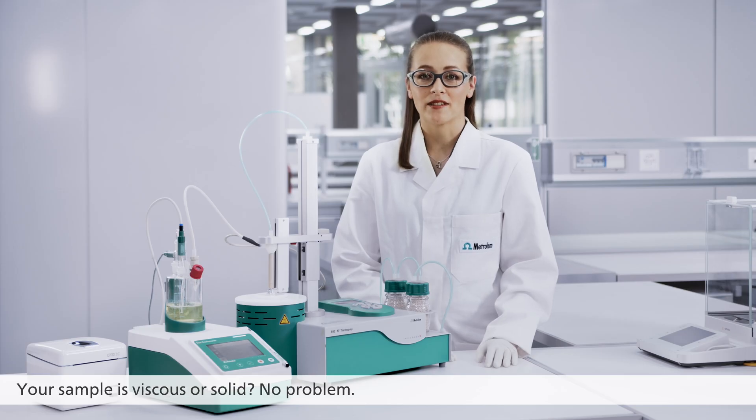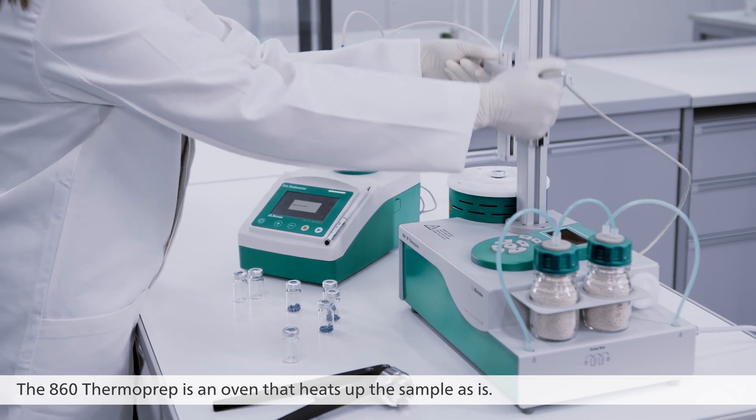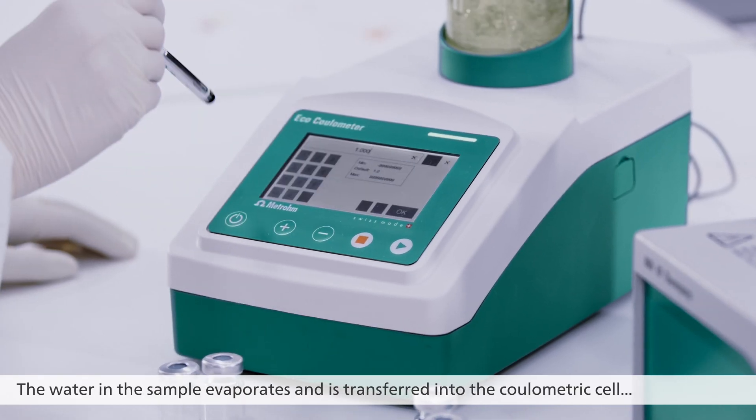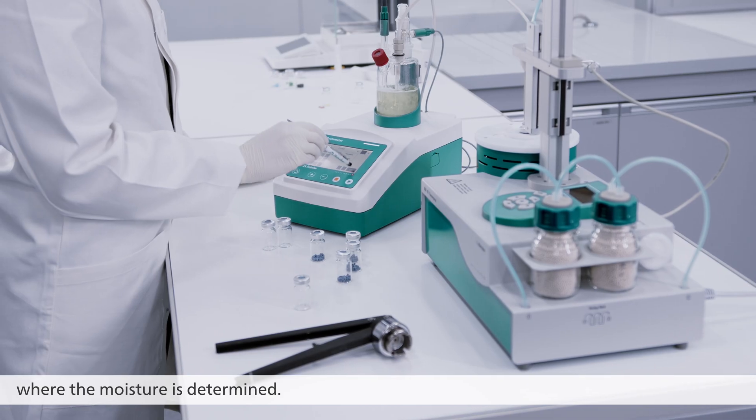Your sample is viscous or solid? No problem! The 862 Thermo Prep is an oven that heats up the sample as is. The water in the sample evaporates and is transferred into the coulometric cell where the moisture is determined.